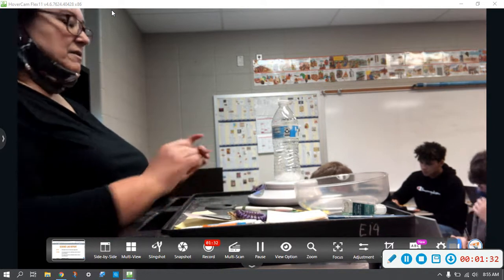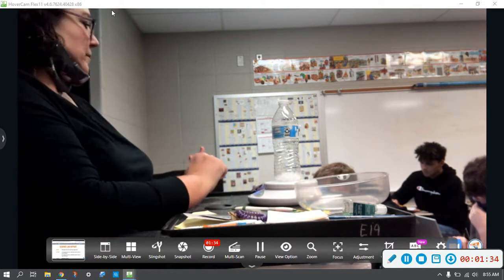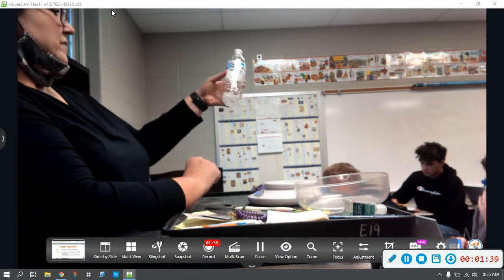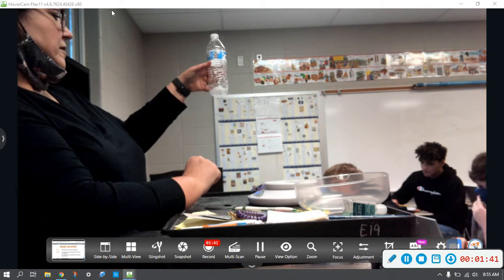Now I'm going to melt the ice. Is that the starting mass? Yes, that's the starting mass. And we're doing data and procedures at the same time? Yes. Was it 32.2? 32.2.